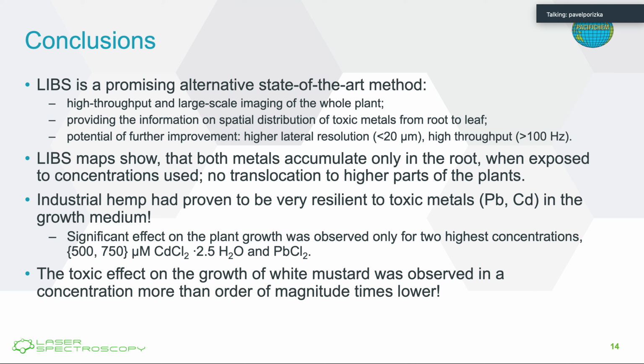We are also working right now on the imaging of soft tissues, of small fish samples, to really see lead and cadmium in small fish samples. But this is more difficult also due to some ethical issues that need to be solved first before the analysis of fish and other animals.